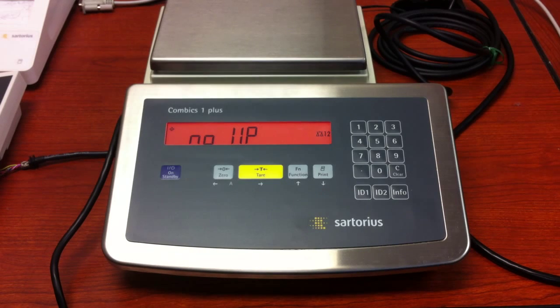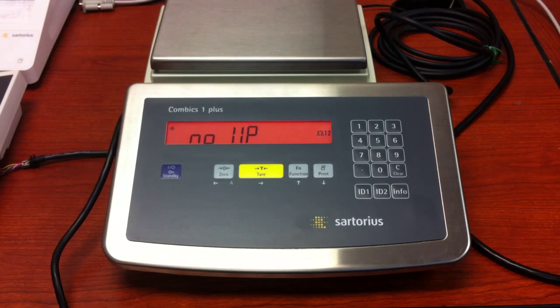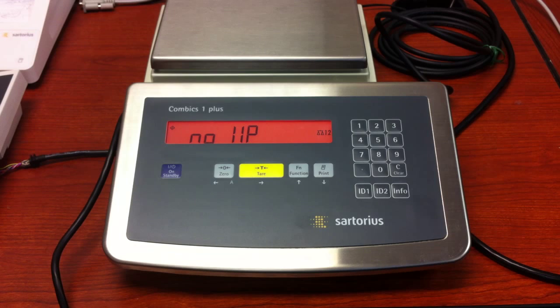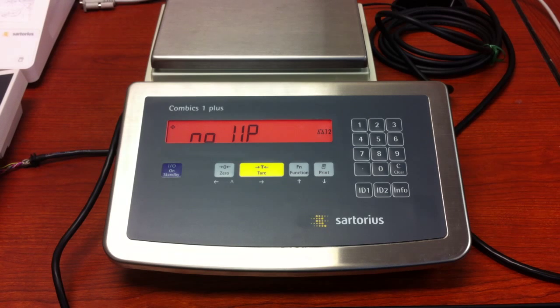This video deals with restoring your connection between your IS or Sotorius digital platform connected to your indicator with the option card for the 485 connection. If you ever turn the scale on and you see a 'no WP' or 'no 11p,' and you're dealing with the digital platform, in order to restore the connection we need to follow a specific path.